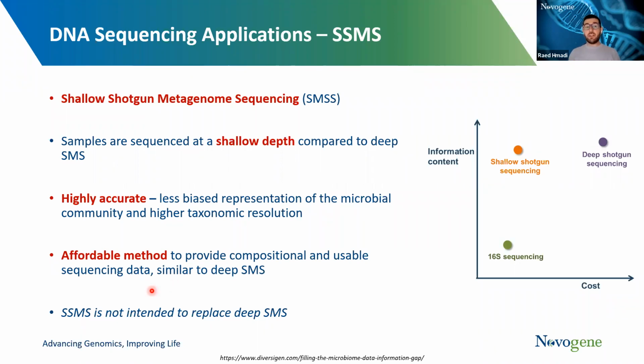I would like to stress here that shallow shotgun metagenome sequencing is not intended to fully replace deep shotgun metagenome sequencing.